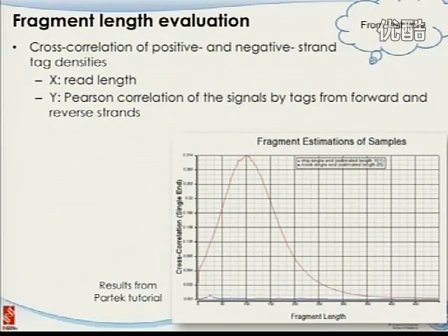And so people initially tried to decide that just experimentally. They got the gel pictures, they ran the gel, and then they cut the band and decided what's the range of the DNA fragment that has been used.